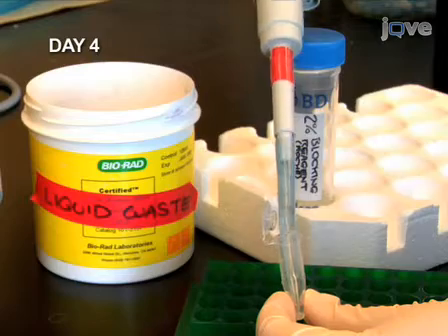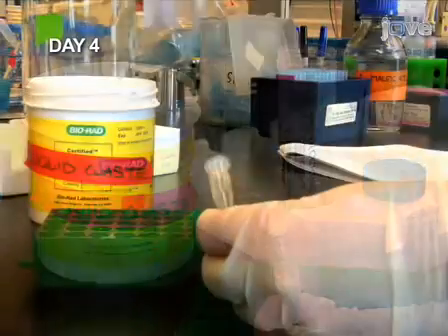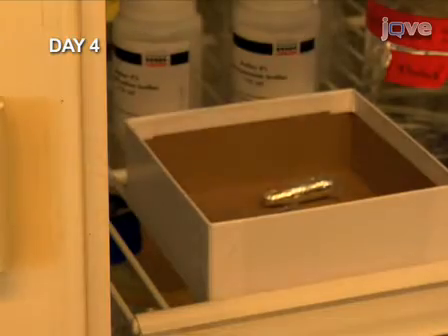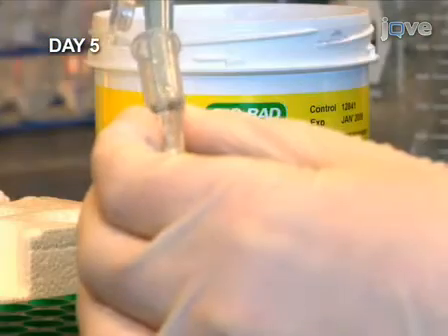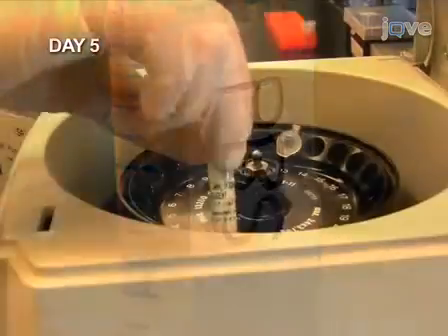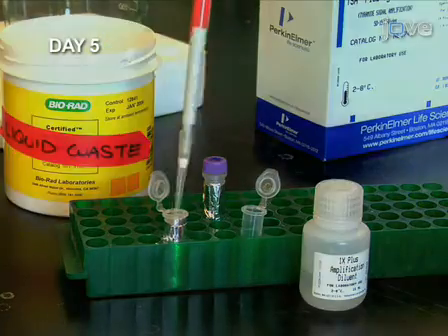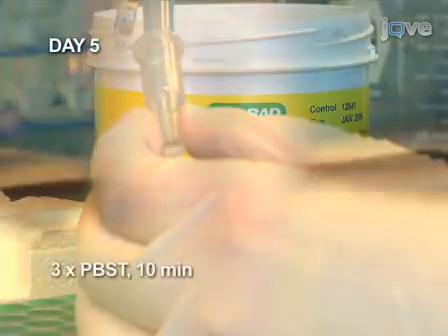Antibody labeling of the digoxygenin probe starts with blocking, as with the previous antibody. Next, add the anti-digoxygenin antibody at a 1 to 1000 dilution. Lay the microcentrifuge tube on its side and incubate overnight in the cold. The next day, wash at room temperature with maleic acid buffer, then with PBS. Quick-spin the Cy5 tyramide substrate, dilute it 1 to 50, and add it to the embryos. Incubate for 45 minutes with the tube on its side. Finally, wash 3 times in PBST.